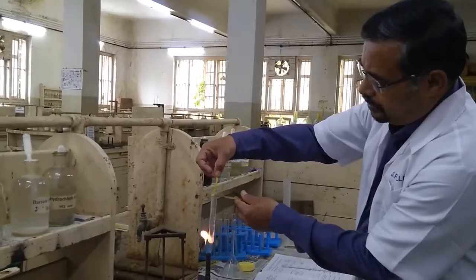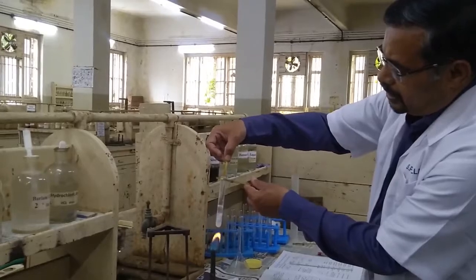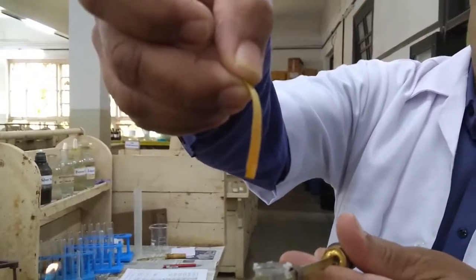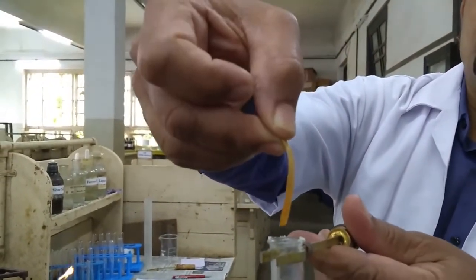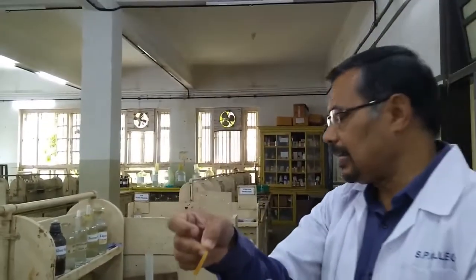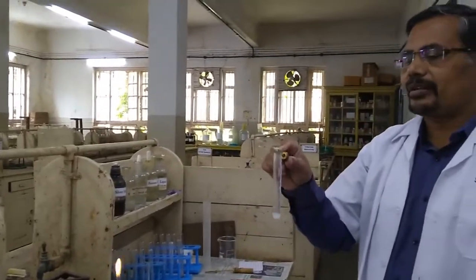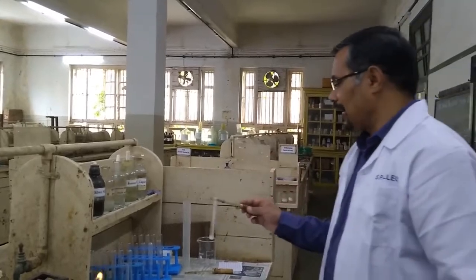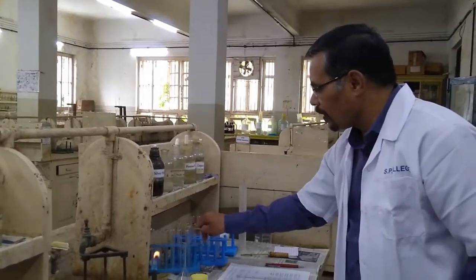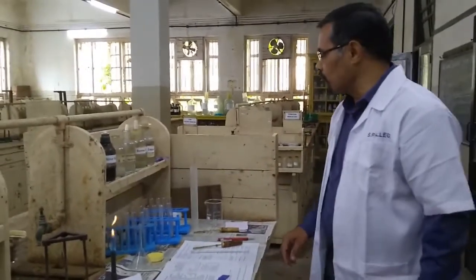Then, due to the vapors of ammonia gas formed in the mixture, the color of the turmeric paper becomes reddish brown. So this indicates the NH4 plus radical is present in the given mixture. So this is an approximate conclusion due to the dry test. Then the next test that we will perform for basic radical analysis is preparation of solution.